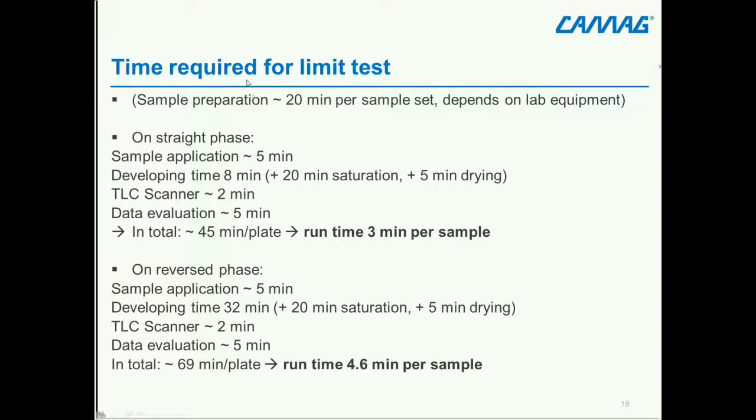So how long does it take to perform the limit test? The sample preparation depends on the lab equipment, so I did not take this into account, but I would say usually it can be done in about 20 minutes per sample set.